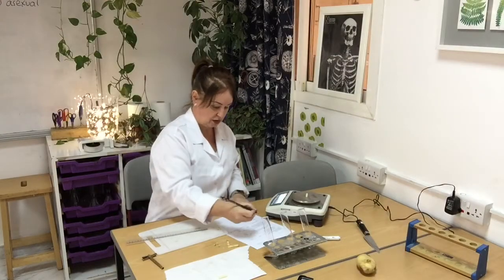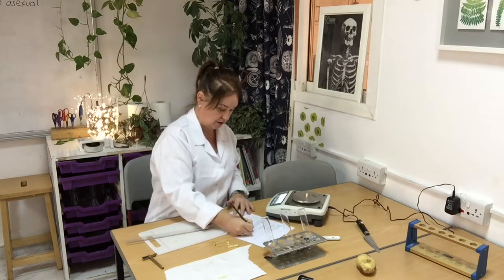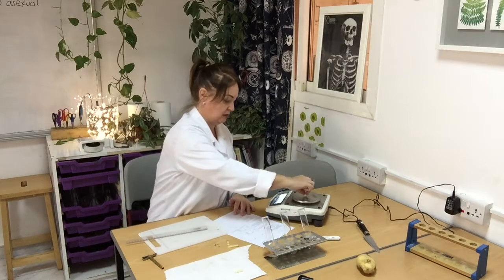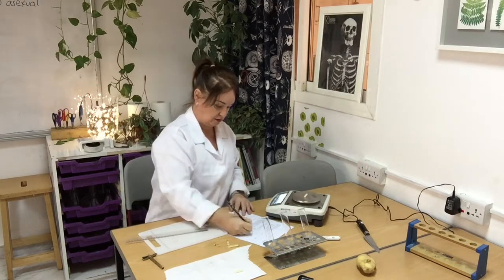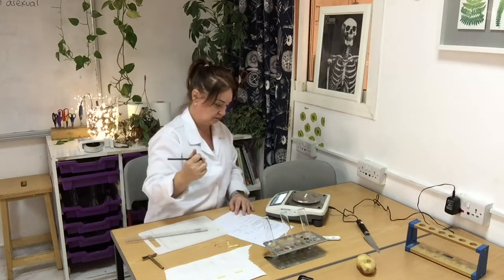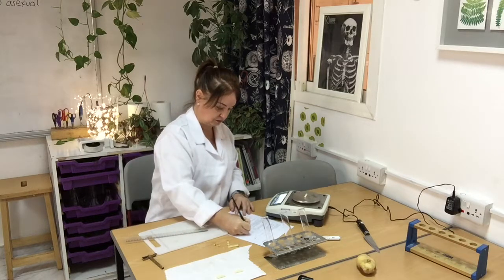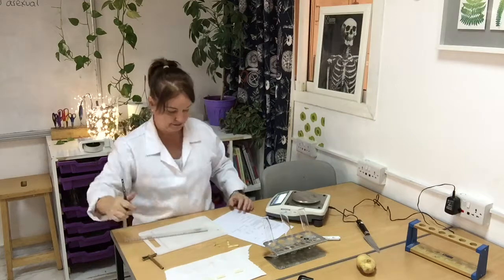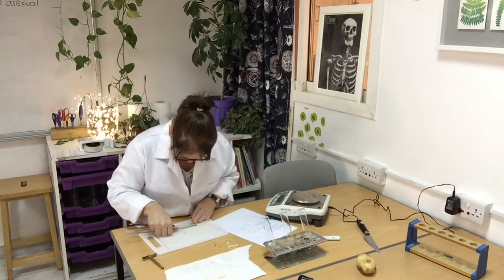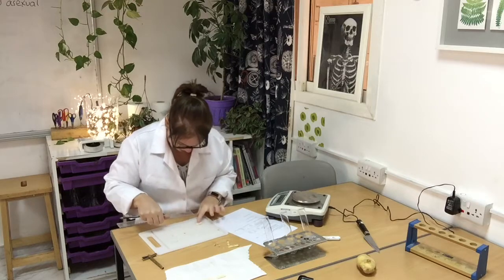I'm now going to measure the mass of each of the potato tubes. I'm going to record the result straight onto my worksheet, and then of course I'm going to measure the length with the ruler. Of course, with the digital balance, just a reminder that that's a reading because we just get one judgment made, whereas when we measure with a ruler, it's a measurement because we use 2 judgments.